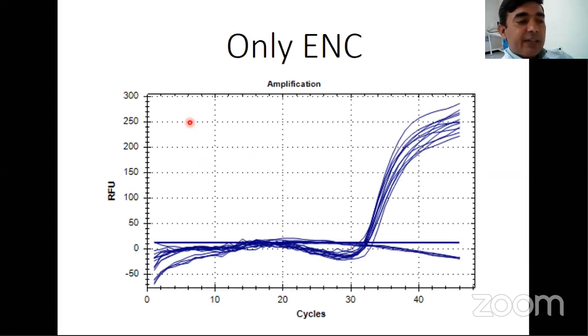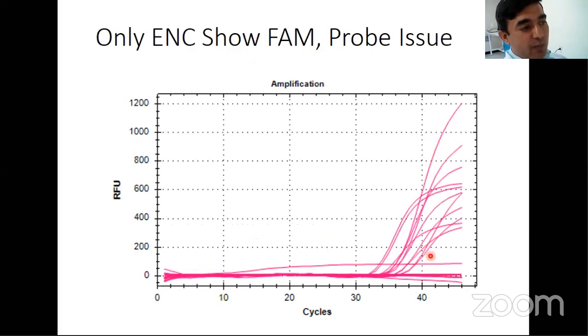Here, the extraction control samples basically tell us the information about the extraction control. If we look over here, multiple wells are selected, which means the selected wells give me some information. In these particular wells, these two wells had no successful extraction performed. We record these wells because there was no proper extraction from them, and we give them for a re-extraction process.